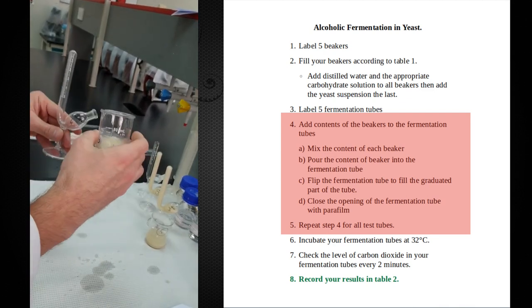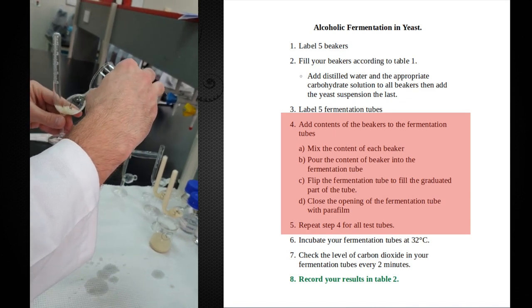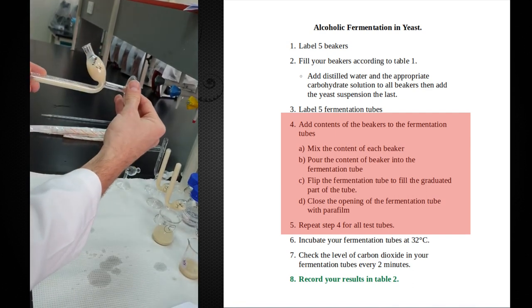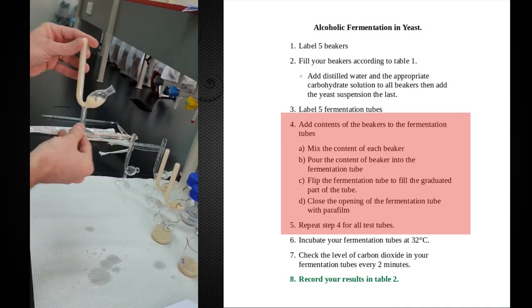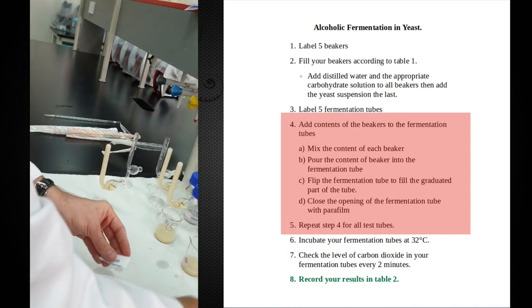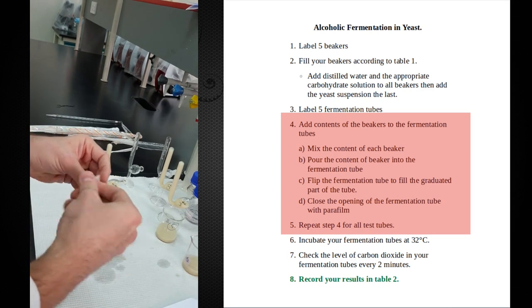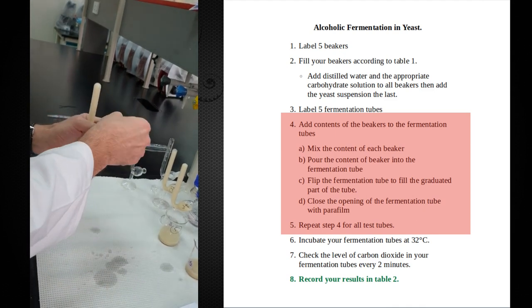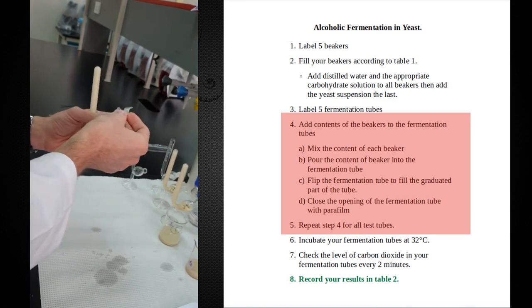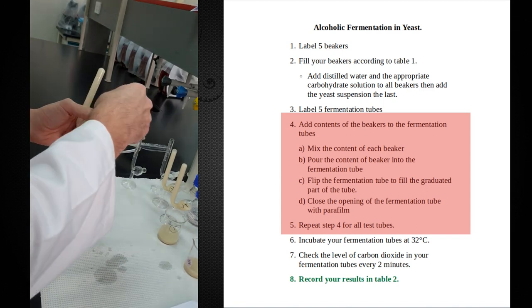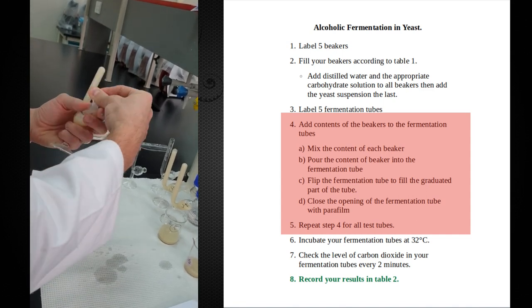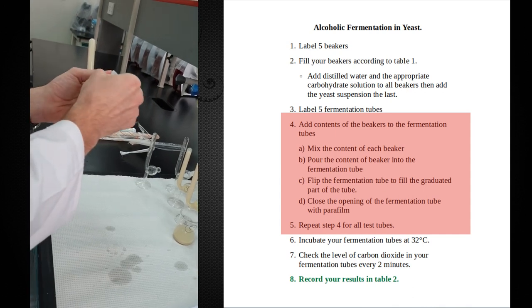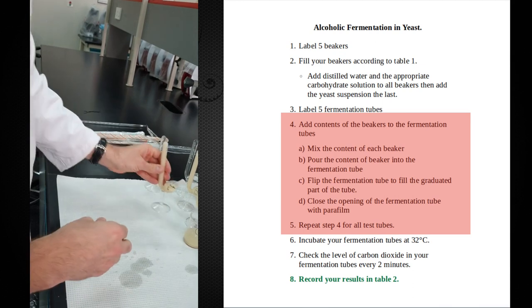Again, mix up your number four. That's your sucrose and yeast. And again, I'm going to fill this, just turn. Nice, tight seal. Number four.